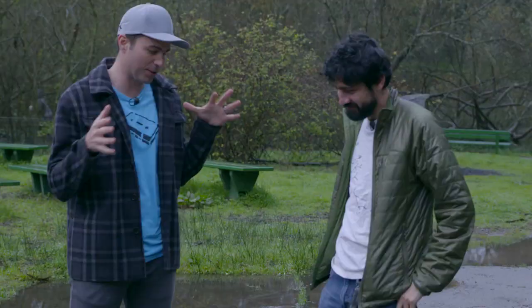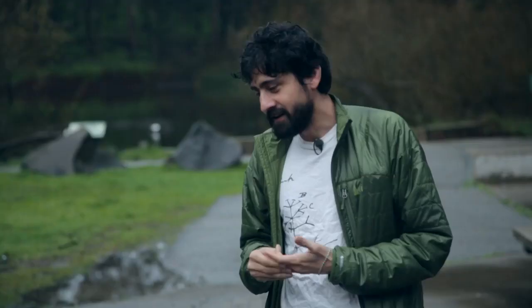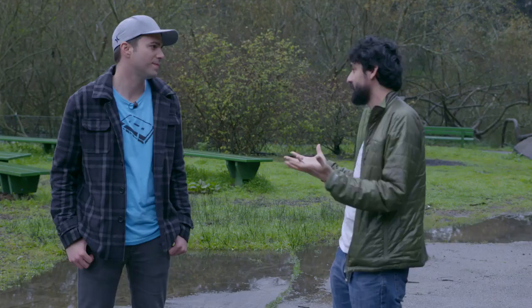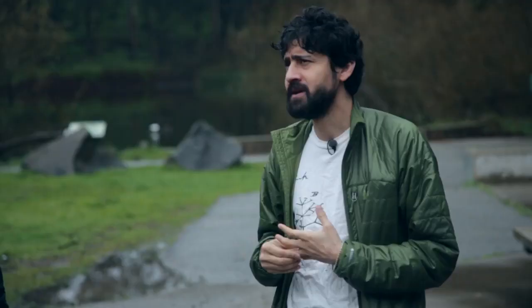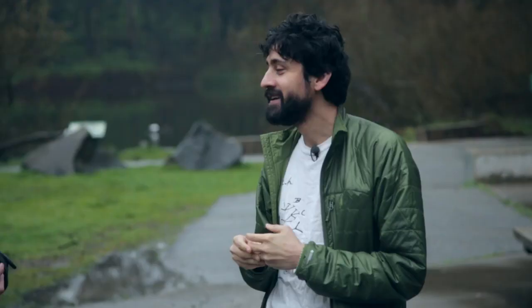Your lab at Stanford — what do you do? What's your mission? I grew up in India, and one of the things I've always enjoyed is getting exposed to scientific tools. When I started the lab, it was very clear that we have this hunger for scientific tools that's missing. So we spend almost 50% of our time building and designing scientific tools under the umbrella of frugal science. It can't cost a ton of money, because every zero that you add to scientific equipment probably cuts off hundreds, thousands, millions, billions of people.